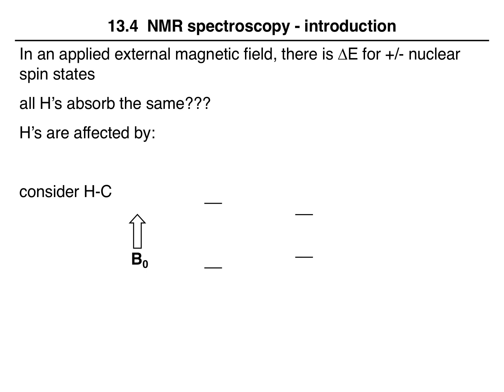So all of the hydrogens in a molecule in the same applied field do not absorb the exact same amount of energy, because the hydrogens are affected by other atoms, especially if we have another atom that is very electronegative. Hydrogens can be affected by bonds, and hydrogens can be affected by the electrons around them. In other words, hydrogens within the same molecule will feel a different environment. We think of it as a different electronic environment.